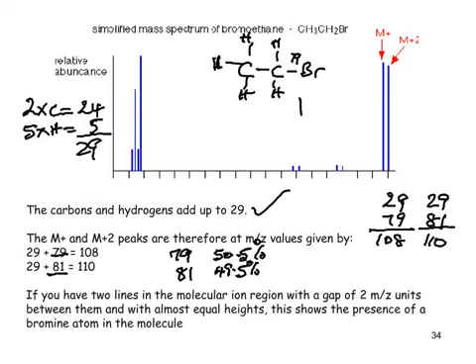Now, the 108, this particular one, which is the molecular ion with the lighter, more abundant isotope of bromine, comes out as 108, which is why, again, these numbers unfortunately are missing. This is 110 here, and this is 100, and this is 90, and so on. So hopefully you can see that indeed that is the case. This particular one is coming out at 98.